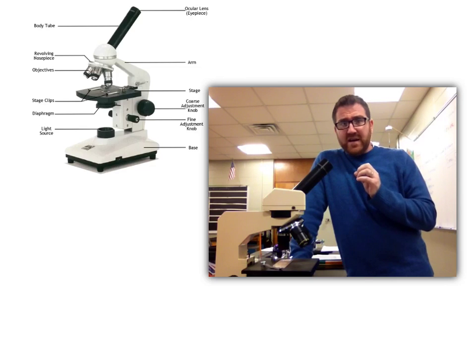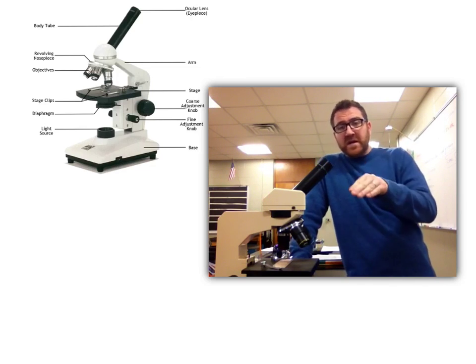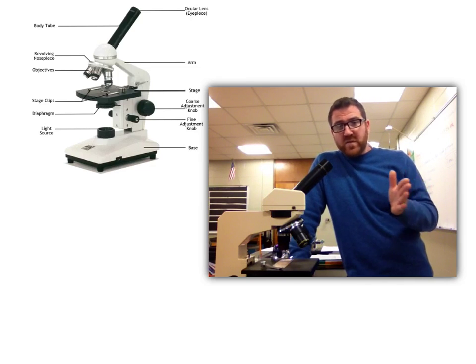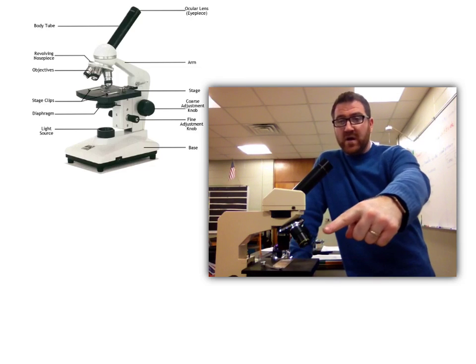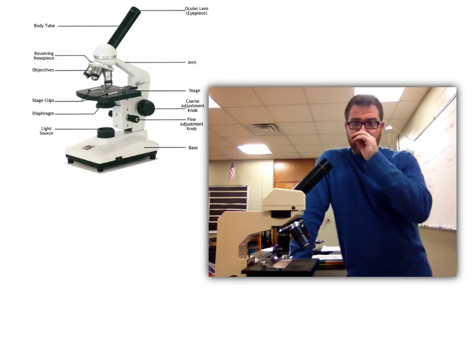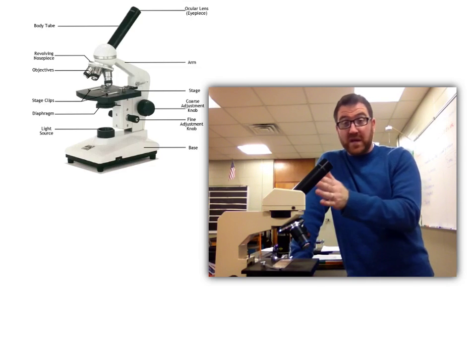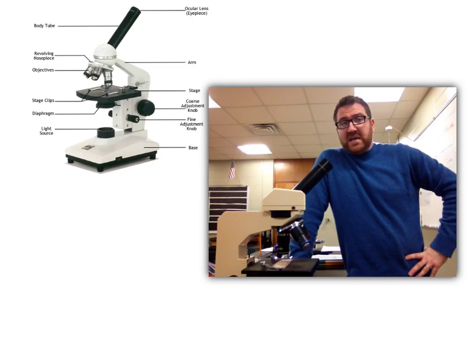if you find something within your specimen that you would like to go a little closer to or investigate a little further, then you need to move to the next highest power objective, which, if we're on low now, the yellow medium power objective would be the one to go to. Now again, my recommendation before moving from low to medium power or medium to high power, is that you put the specimen in the middle of your viewing window.